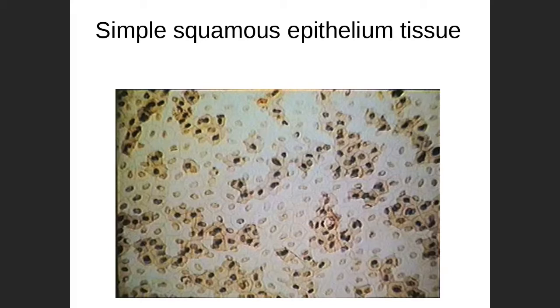It's Dr. Kaz, and this is the Chapter 5 Tissue Lab Slide Identification. So we're going to run through some of the slides here that you are responsible for in Chapter 5 for the first lab test. So let's jump into it here and talk about simple squamous epithelial tissue.